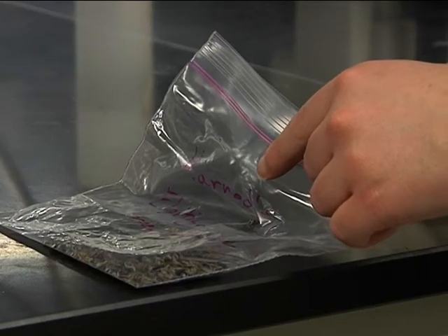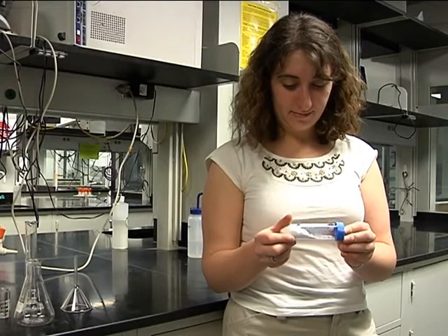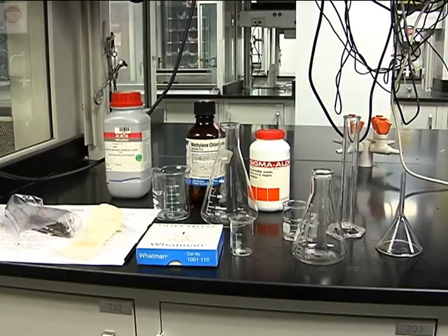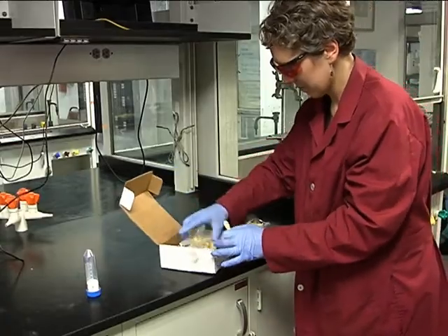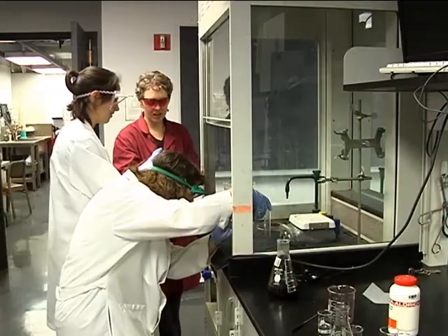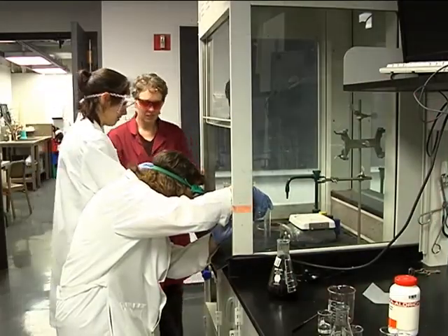Different kinds of teas have different levels of caffeine. For two reporters to measure how much caffeine is in a particular type of tea, we need the help of a lab to separate caffeine from the other components of the drink. Shelby Hatch, director of the undergraduate general chemistry lab at Northwestern University, helps us run an experiment to extract the caffeine from tea.